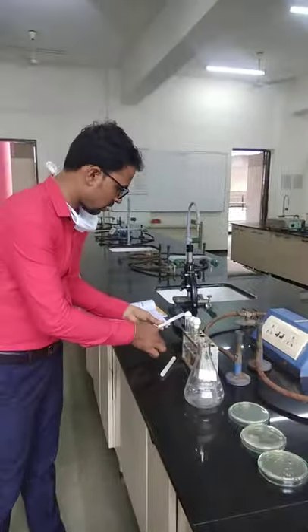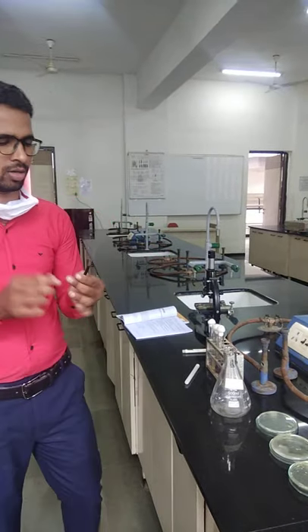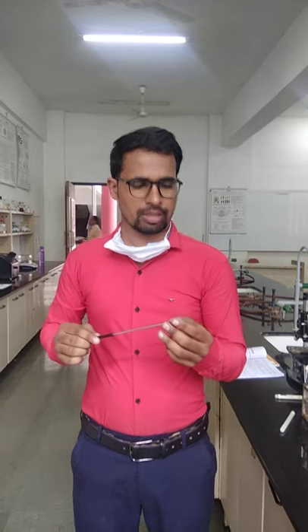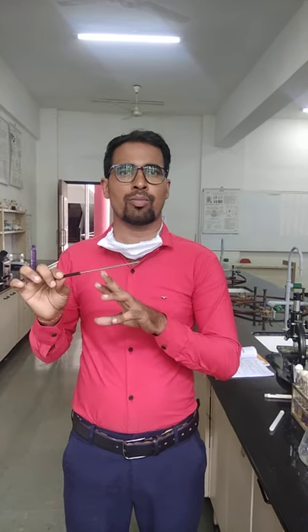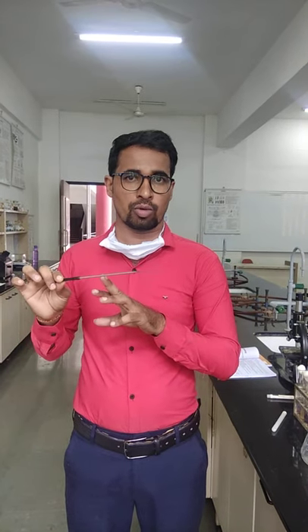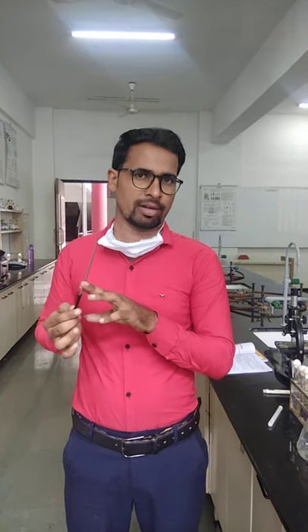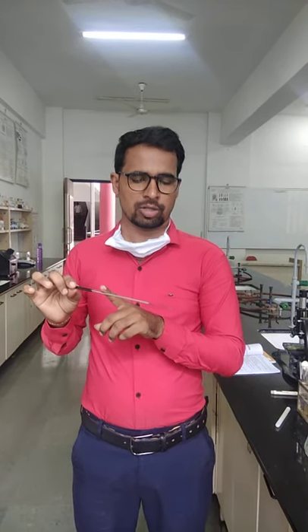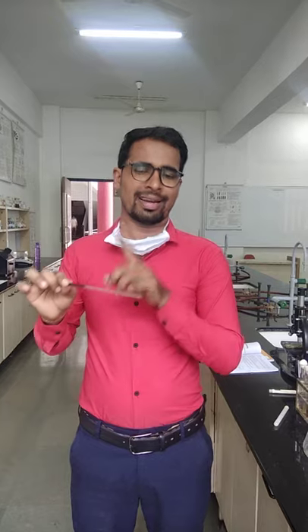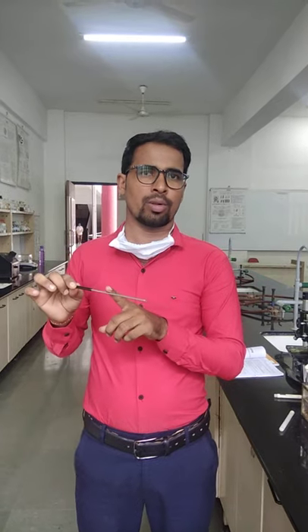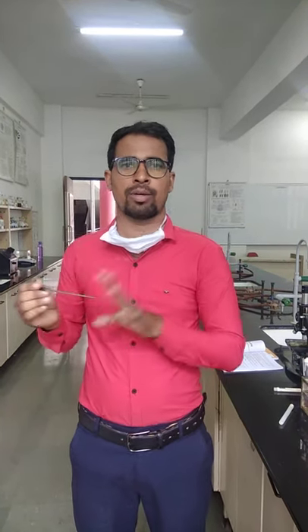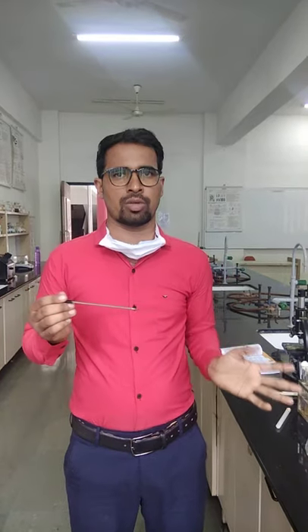We will take the very first instrument, or you can say apparatus. This is the nichrome wire. We already studied it in the theory part. So this is made up of nichrome, that's why it is called as the nichrome wire, and it has a role for the transfer of microbial flora from one place to another.